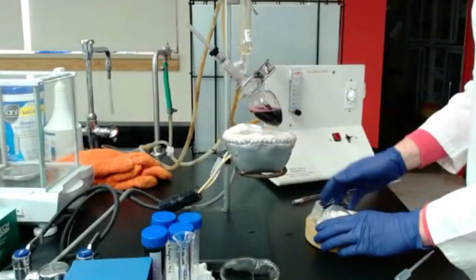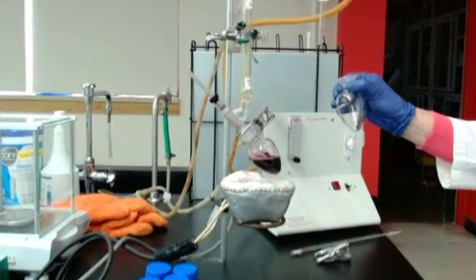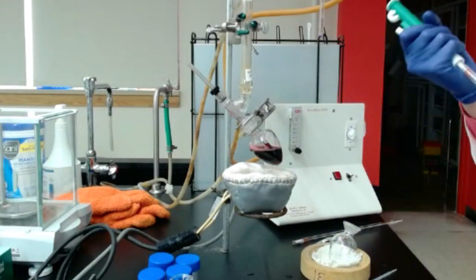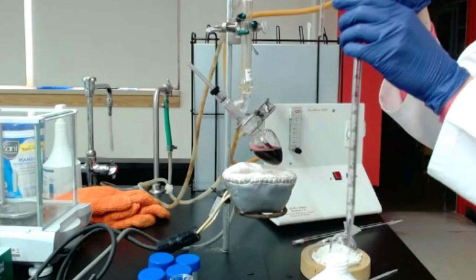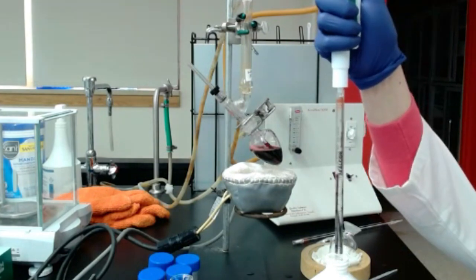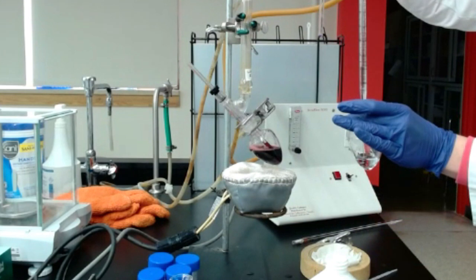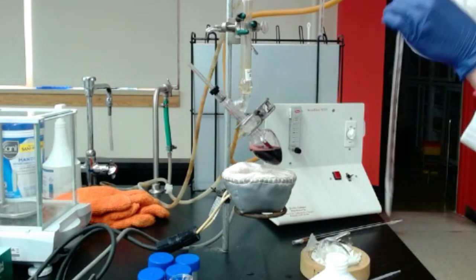So while it's heating, I'm going to prepare again that flask that's going to contain hydrogen peroxide and a little bit of sodium hydroxide. In this flask, I'm going to add 10 milliliters of hydrogen peroxide again, with that pipette. So I just start. I take 10 milliliters, that I transfer directly into that cylinder. I remove that before putting that pipette pump away.